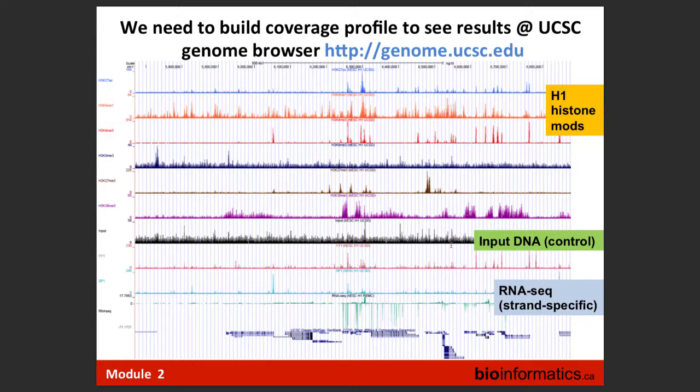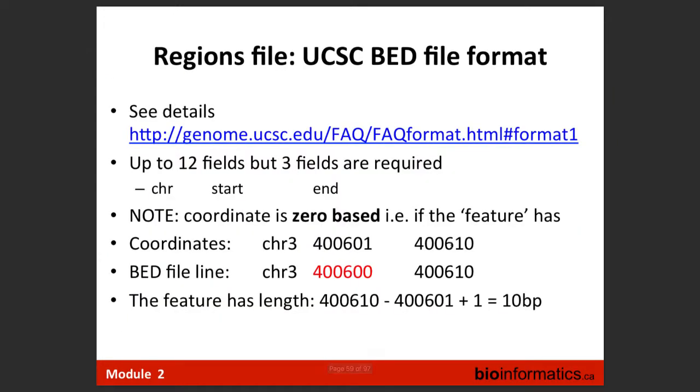I think we should cruise a little bit. We have half an hour. So this is about visualization. Are you familiar with BED format, or maybe a few words? Because here there are some tricks and some gotchas. They are nicely described at the UCSC browser. There is a nice frequently asked questions page, and all details about formats are there.